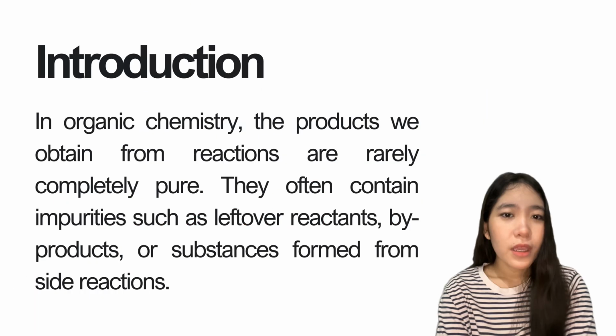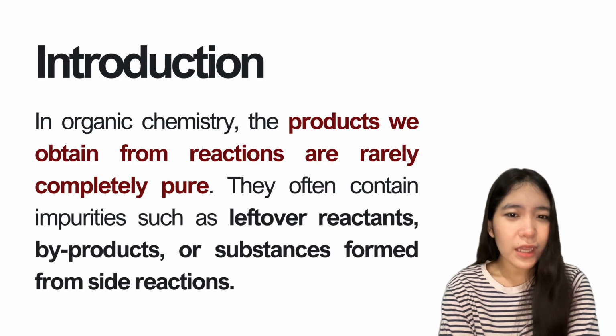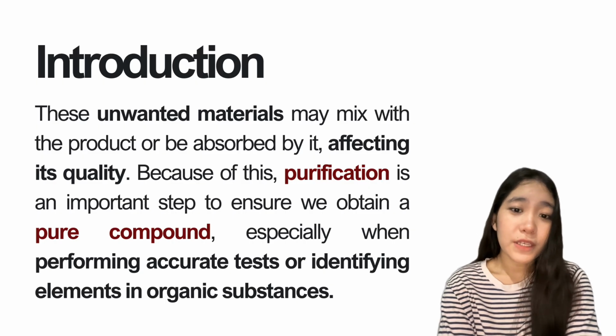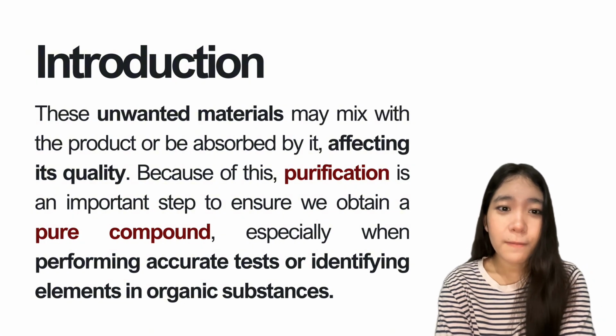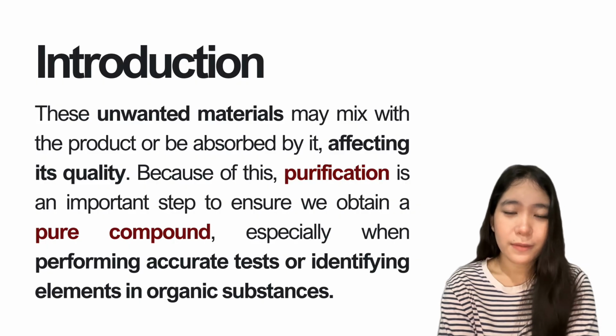So to start, in organic chemistry, the products we obtain from reactions are rarely completely pure. They often contain impurities such as leftover reactants, byproducts, or substances formed from side reactions. These unwanted materials may mix with the product or be absorbed by it, affecting its quality. Because of this, purification is an important step to ensure we obtain a pure compound, especially when performing accurate tests or identifying elements in organic substances.